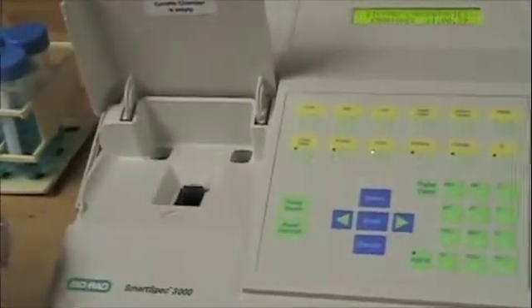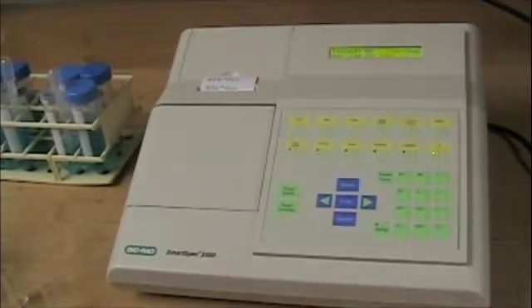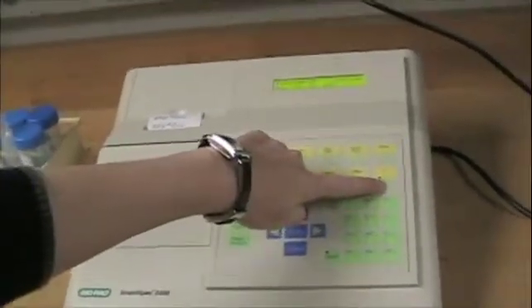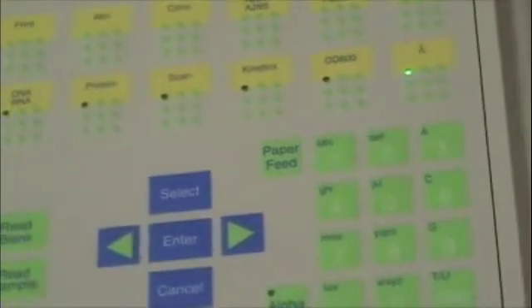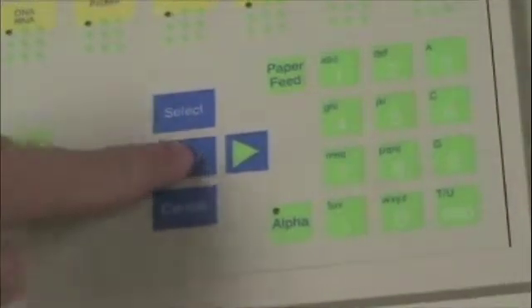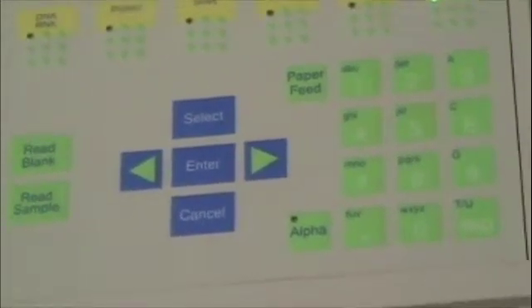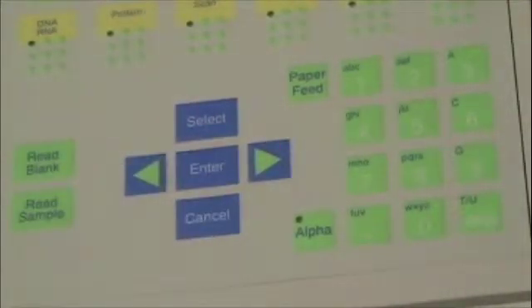Let's get the spec set up and then we'll blank the spec to set a zero value. The first thing we're going to do is tell it that we want it to read wavelength, so I'm going to press this wavelength button. It asks me how many wavelengths I want to read — we're just going to read one wavelength, so I'll press one and press enter. Then it asks what wavelength we want to read at. For this lab we are doing 620 nanometers, so I'll enter that and press enter. Now we are all ready to read.